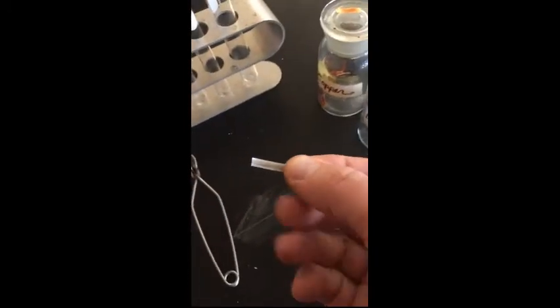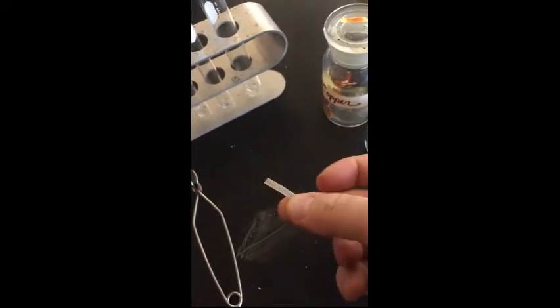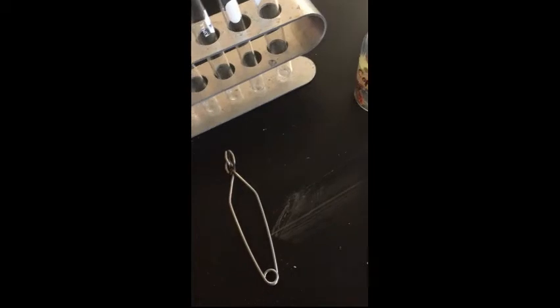Second part of this is taking a magnesium strip. Here's before. We'll burn it.